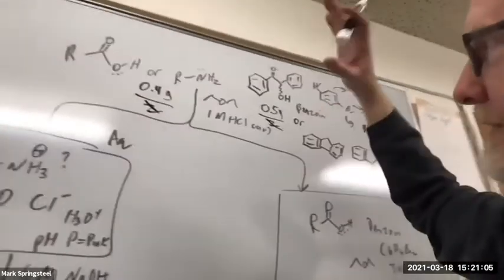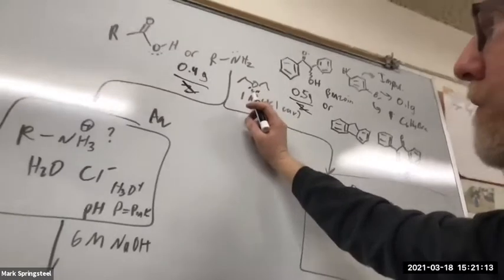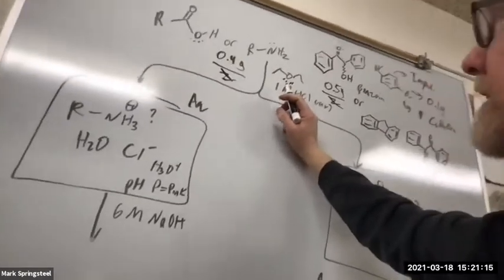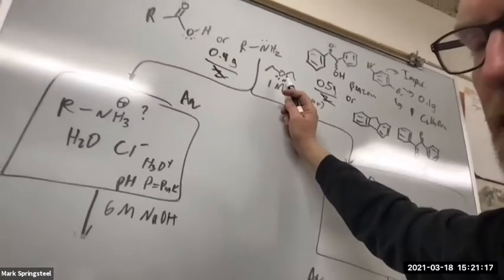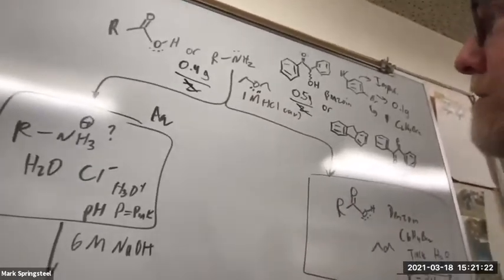So anyways, once I have this mixture, I'm going to try to dissolve it in diethyl ether, because we did methylene chloride last time. I'm hoping they all dissolve in diethyl ether so you get to see what another organic solvent looks like in an extraction. Diethyl ether is less dense than water, so now it'll be on the top layer instead of the bottom layer like methylene chloride was.